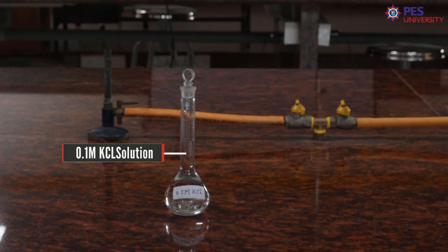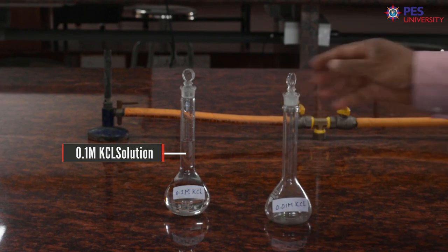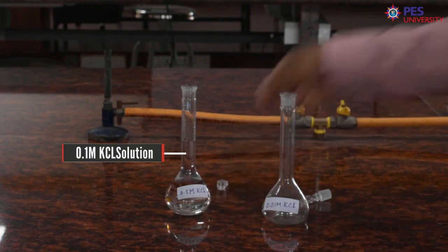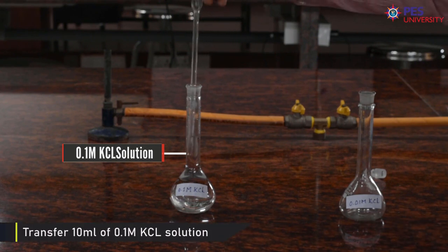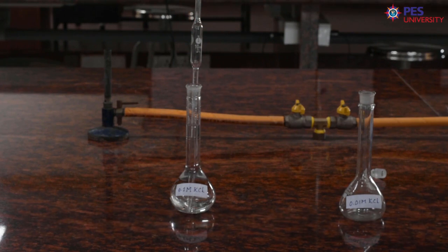For that, take one more 100 ml volumetric flask. For the preparation of 0.01 molar KCl solution, let us pipette out 10 ml of 0.1 molar KCl solution using a 10 ml pipette.